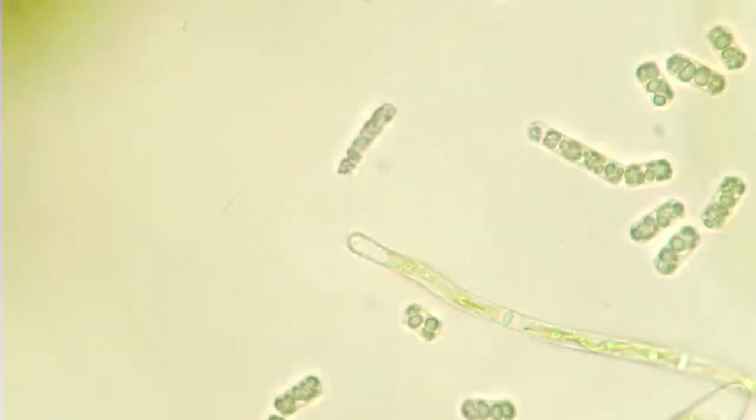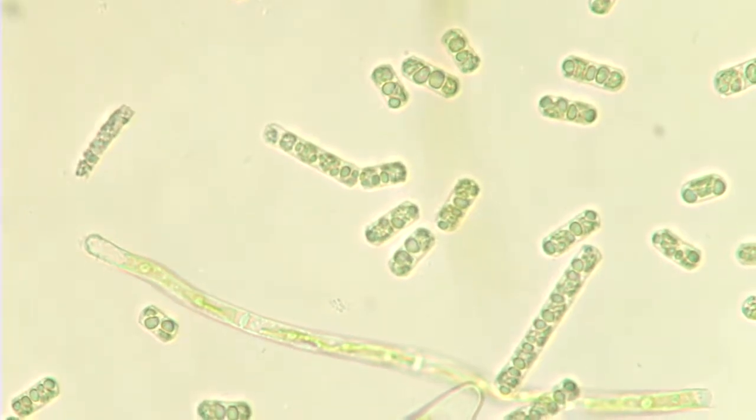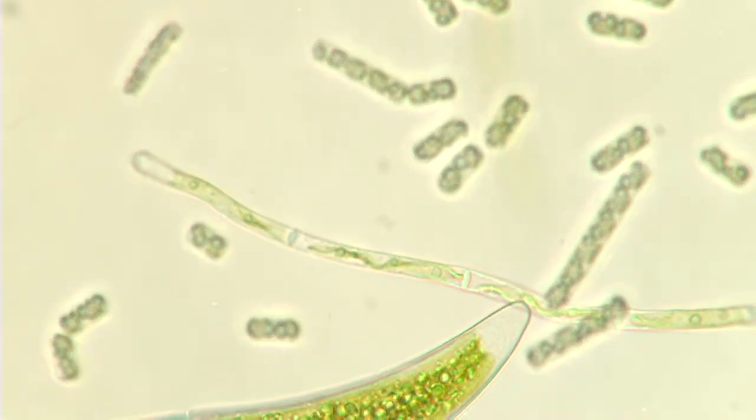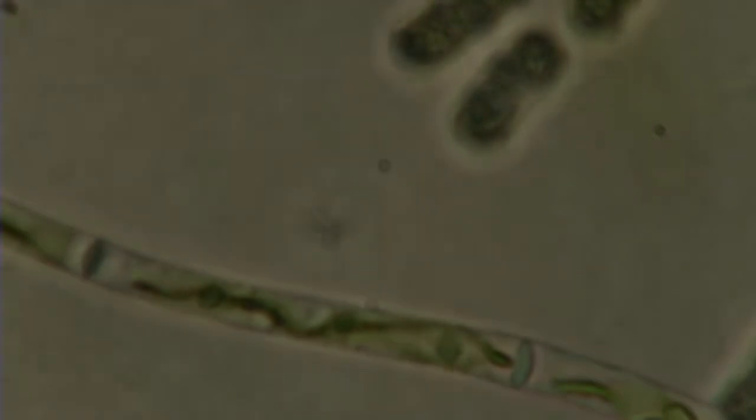And then we have this guy — here's Mougeotia, the axial chloroplast. You can see it down the center nicely here. Let's see if I can get a better picture for you. It's super dark. Yeah, I'm working on that.